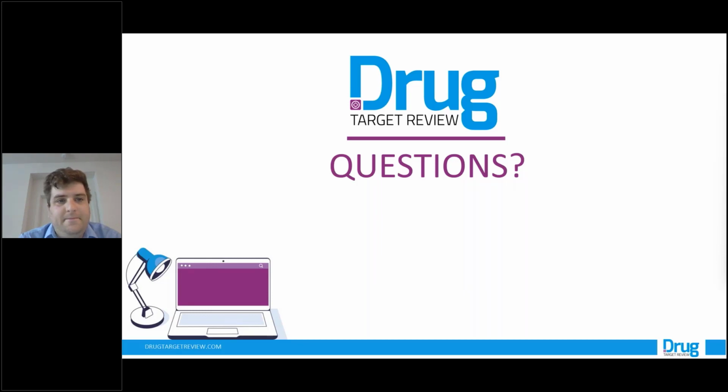Thank you so much. And I think we have time for one more question. How does the assay work where targets have tandem SH2 domains? Right, so we have two assays currently in the panel, the one for ZAP70 and for SYK, which contain two tandem SH2 domain modules because they interact with their natural substrates via the two SH2 domain binding mechanism, where they interact with two closely located phosphotyrosine residues on their target substrates.